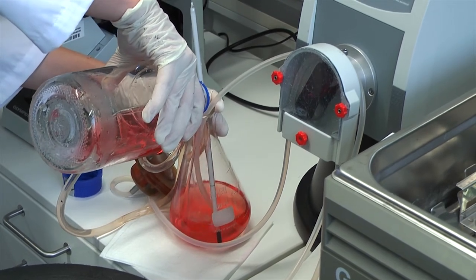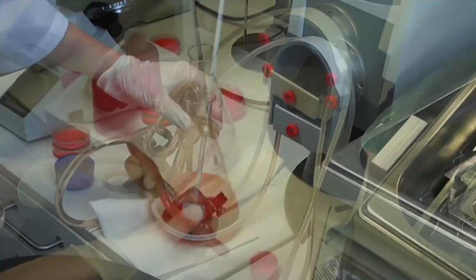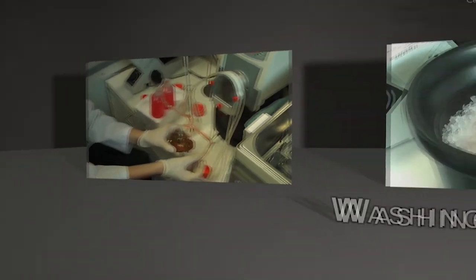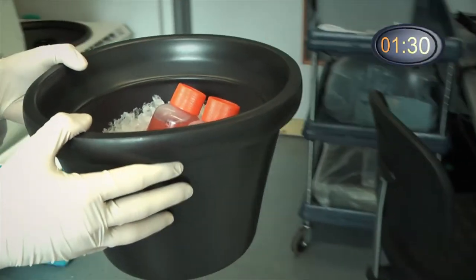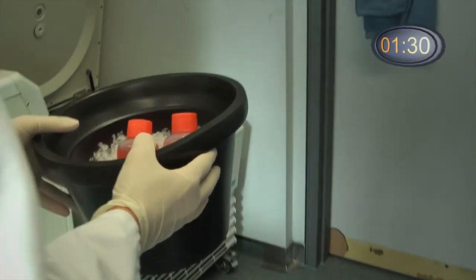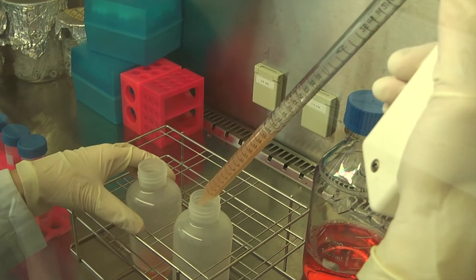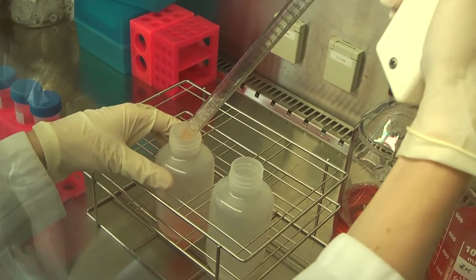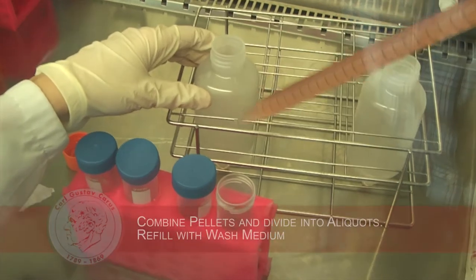Afterwards, we collect the islet solution by inserting the sample tube into 250 ml falcons until the circuit is empty. The following washing procedure starts with a centrifugation step of 1000 rpm at 4 degrees Celsius for 5 minutes. In the next step, we discard the supernatant, resuspend the islet solution in wash media, and distribute it in equal fractions to the 50 ml falcons.